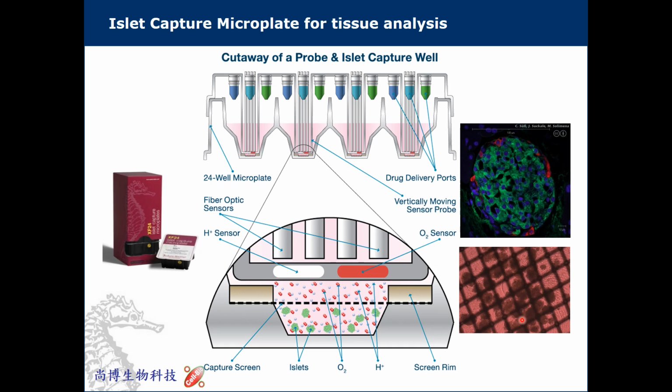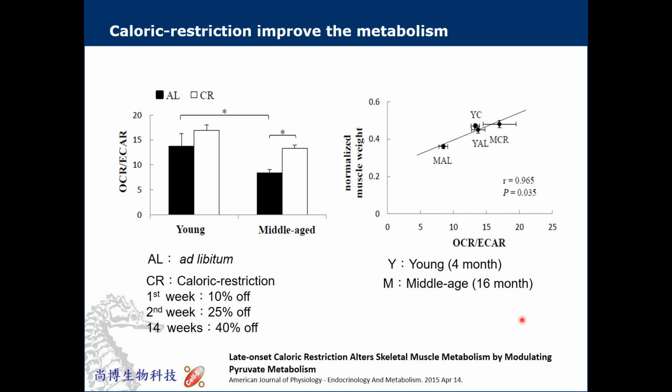So actually we just measure the basal OCR and the basal ECAR, but it is already enough, because we do not need to do the stress test. It is because the difference between cell lines is very small, but the difference between each different tissue of different mice is very obvious. So it is very good to do just the basal OCR and the basal ECAR.